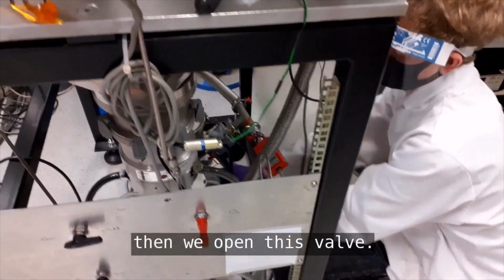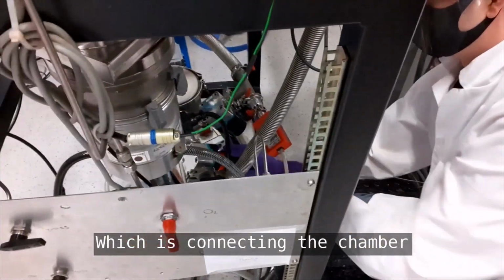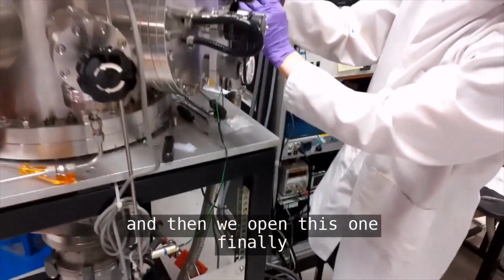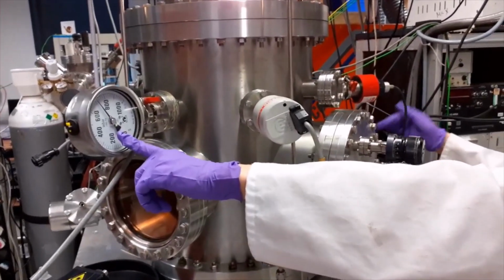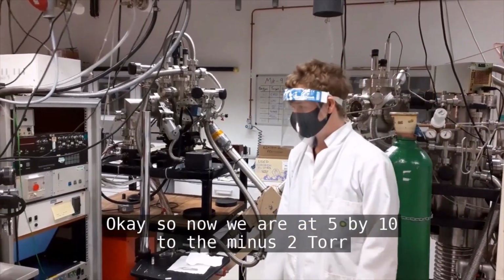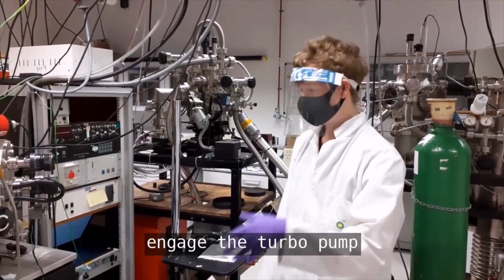Then we open this valve, which is connecting the chamber through to this pump here, and then we open this one finally. We should see the pressure drop on here. Okay, so we're now at 5 times 10 to the minus 2, just below. So it's now safe to engage the turbo pump.